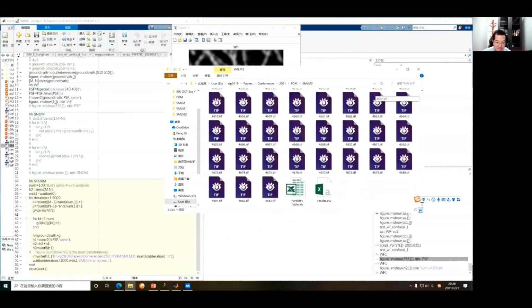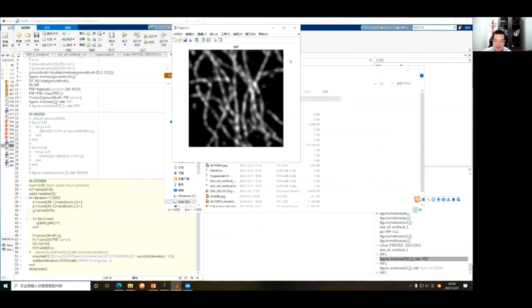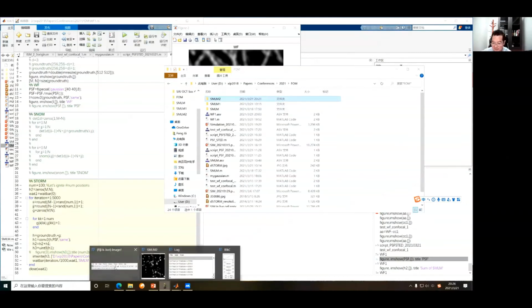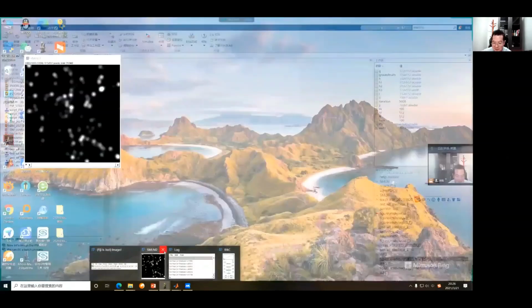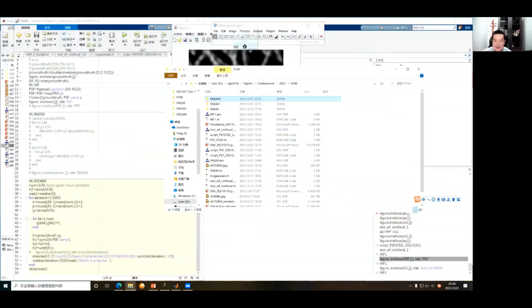It is working slowly, almost done. Okay, now it's done. And let's close the original one. Redrag it there. Open all 5,000 images, yes. It may take a longer time because of the data density.